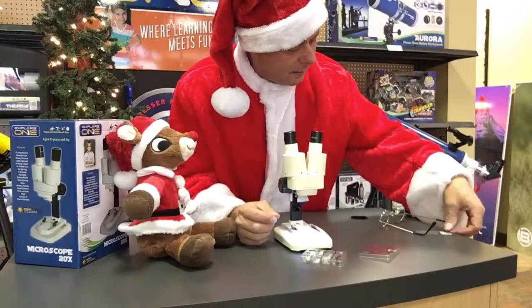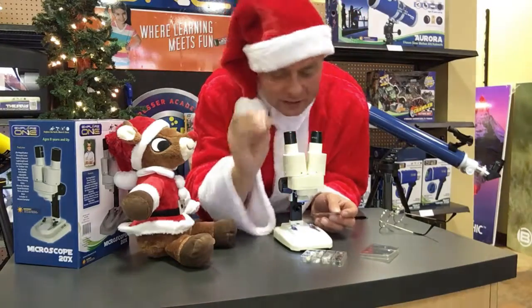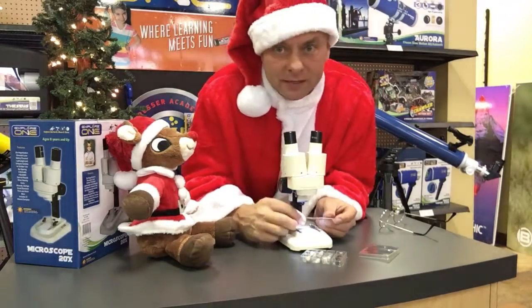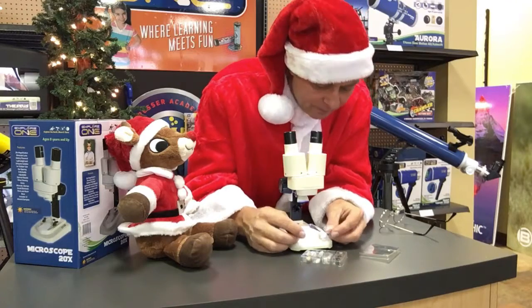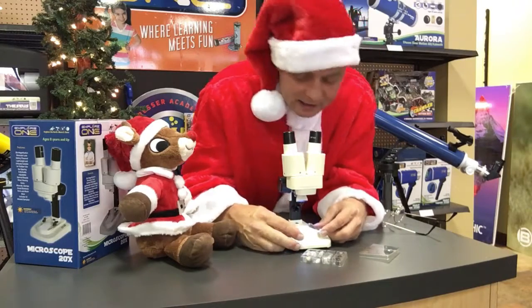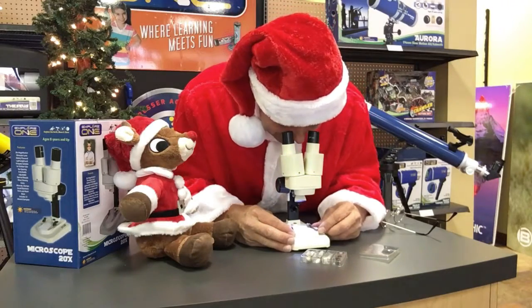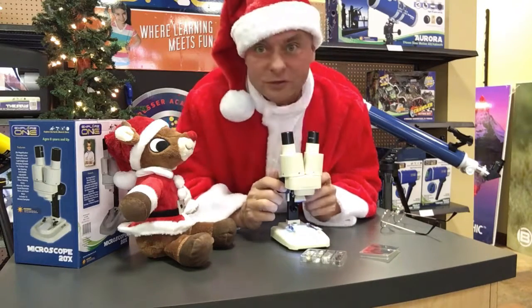Look at the amazing views through this microscope. You'll notice that aside from looking at things like a stone or any 3D object like that, even insects that are alive — you won't harm them, take care of them — you can see them on the field plate down here. These little tabs raise up like so, and they can hold a microscope slide. So if you already have some microscope slides or you want to buy some or make some, it's easy enough. And it makes a beautiful 20x magnified view, which is razor sharp.